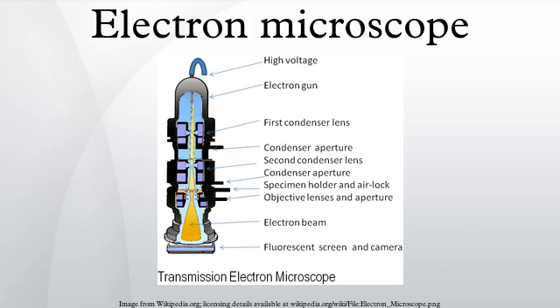The image displayed by an SEM maps the varying intensity of any of these signals into the image in a position corresponding to the position of the beam on the specimen when the signal was generated. In the SEM image of an ant shown at right, the image was constructed from signals produced by a secondary electron detector, the normal or conventional imaging mode in most SEMs.